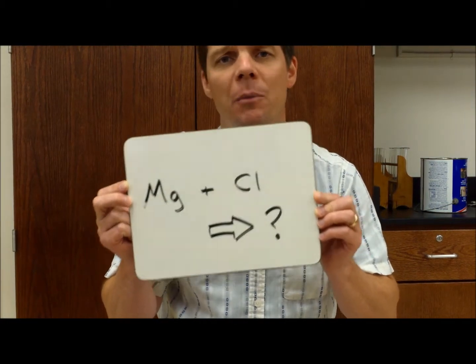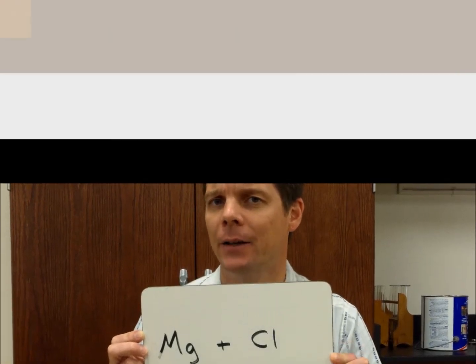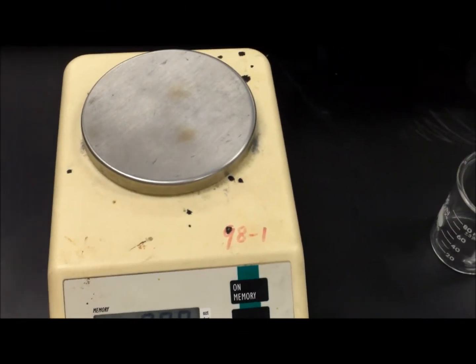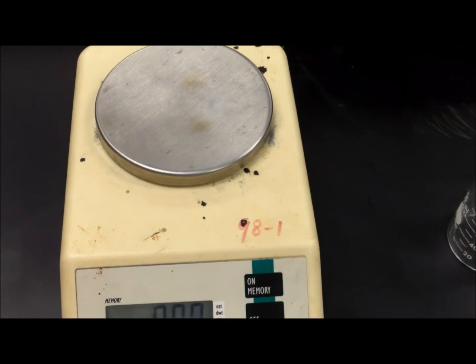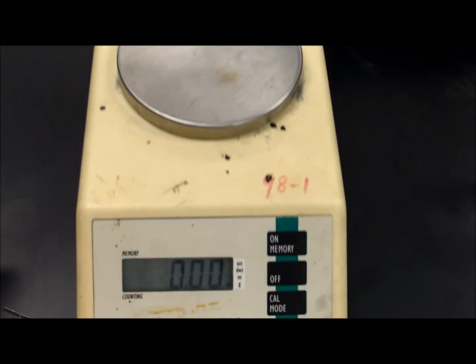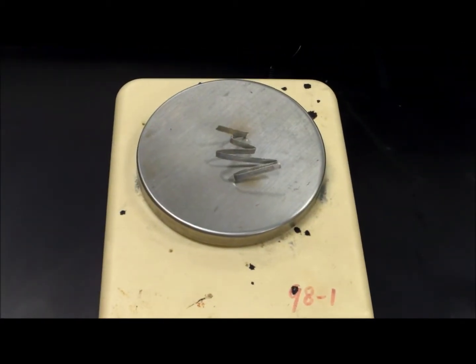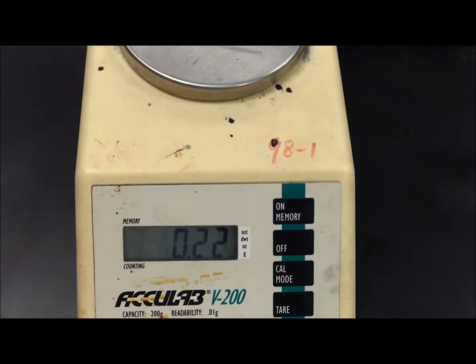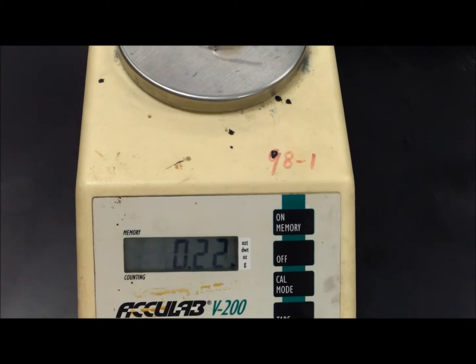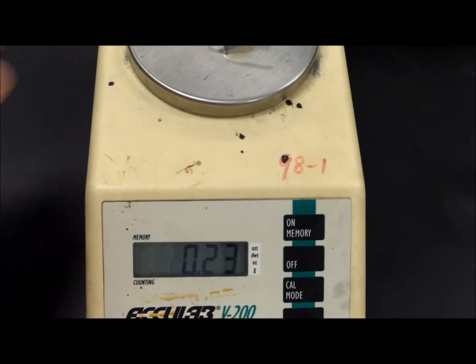The next step in our lab is to measure the masses of a few materials. First, I'm going to measure the mass of that magnesium ribbon. So we can see that the magnesium ribbon has a mass of 0.22 grams.